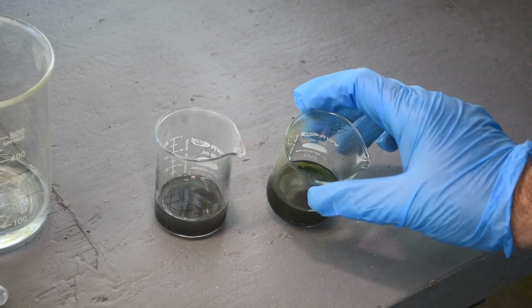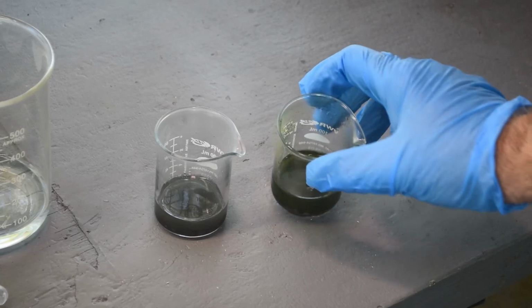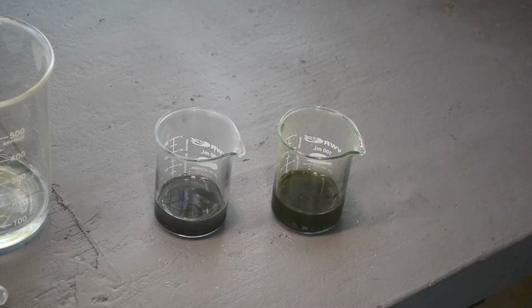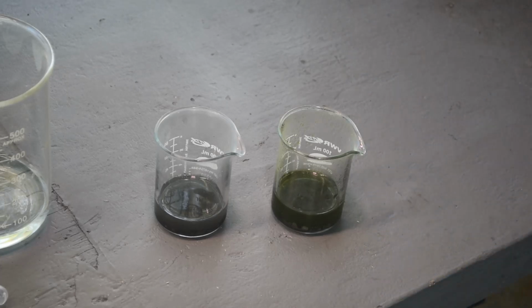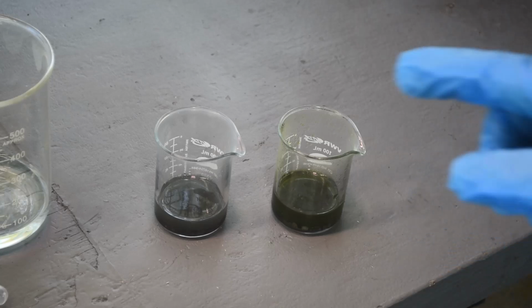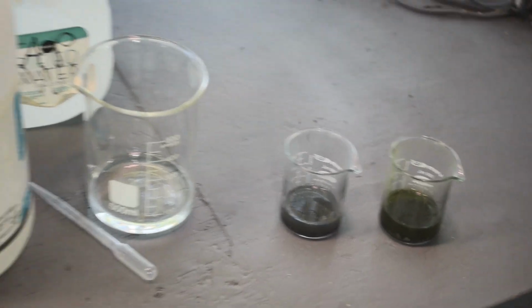So I was kind of leaning towards the hydrochloric acid even before figuring out here that it does it quicker. Just because I've got a lot of this on hand and it's pretty cheap. But there is another consideration that we need to think about. And that is, do we have any silver going into solution? So we're going to run a test here.